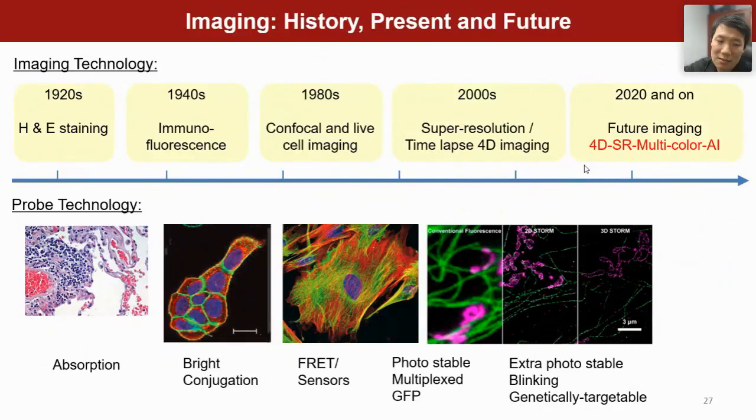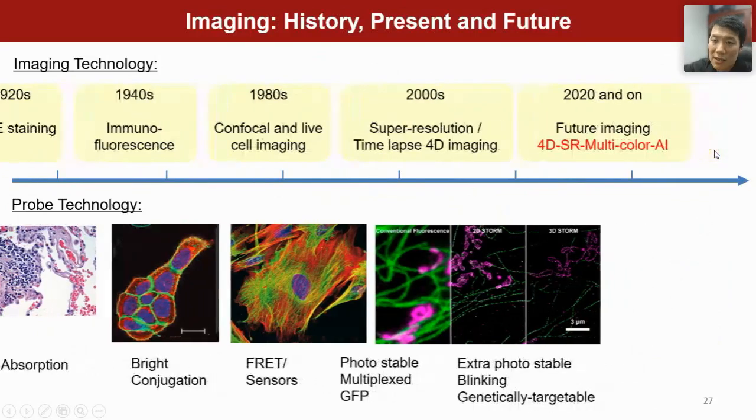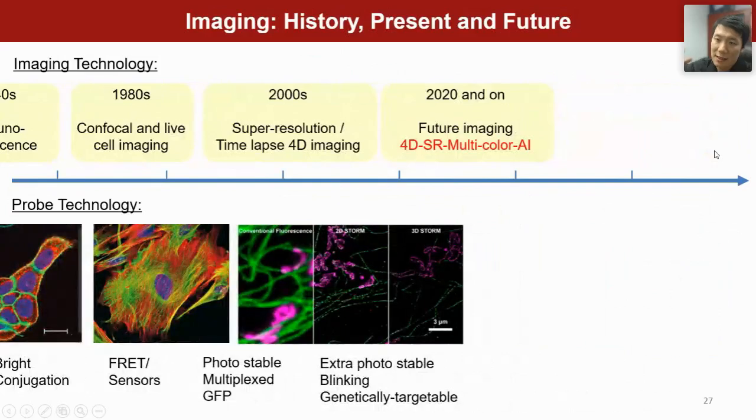That means you're not only doing 3D XYZ, but also time. Time-lapse imaging is becoming increasingly important, so that you have a full amount of data at super resolution and multicolor. Maybe you also have so much data that you have to rely on computers to analyze it. But the infrastructure of this trend is basically, I think, two things.